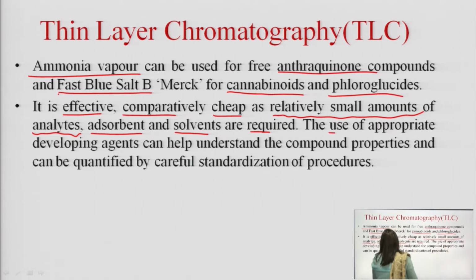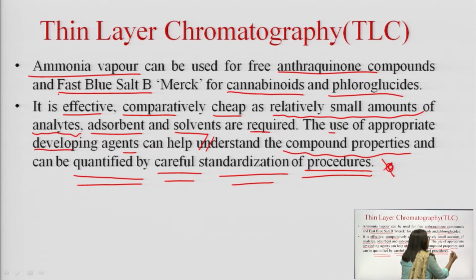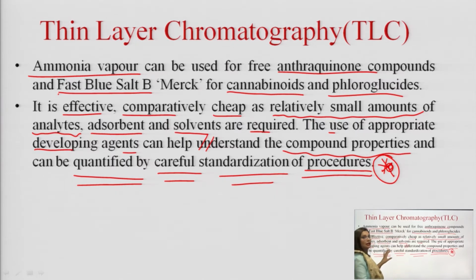Next, the use of an appropriate developing agent can help to understand the compounds and their properties, and they can be quantified by careful standardization of protocols, and hence this method of TLC plays an immense importance in day-to-day pharmaceutical research, as before structural elucidation, before we know what substances the solutes are that we have separated out, we can actually assess the nature of the solute, or even if it is a known substance, simple steps will help us to perform the day-to-day routine analysis of these drugs.